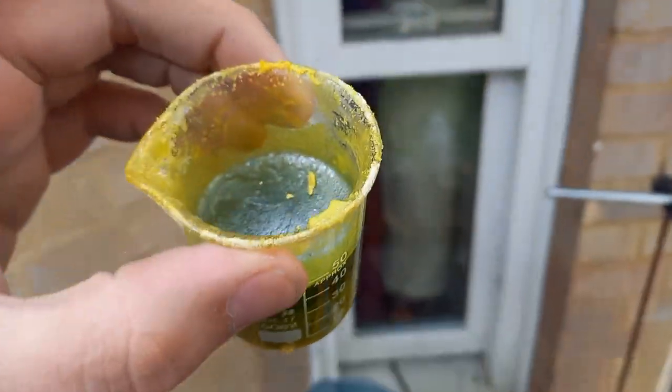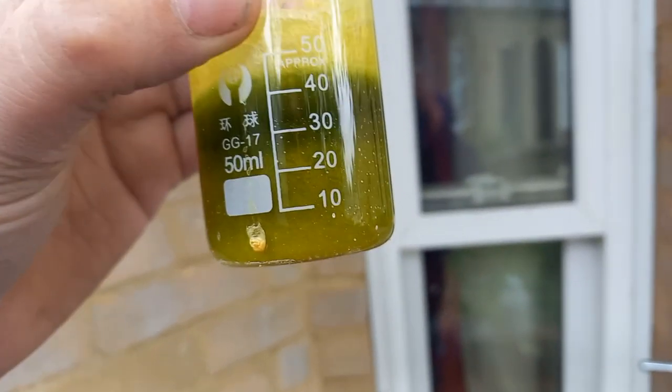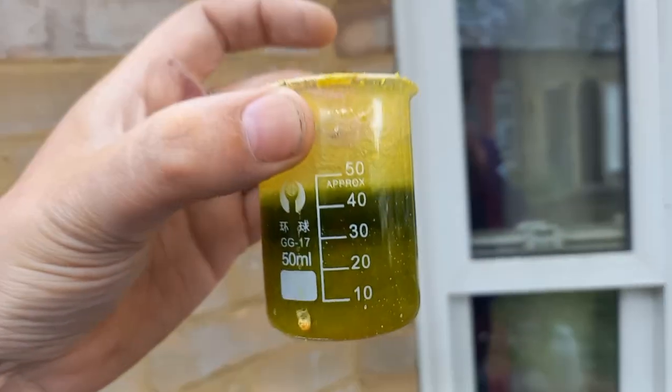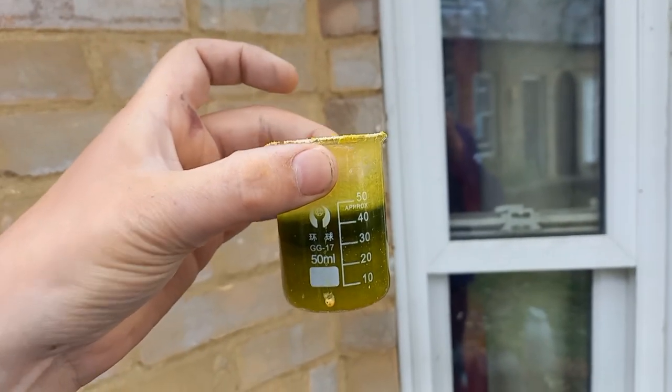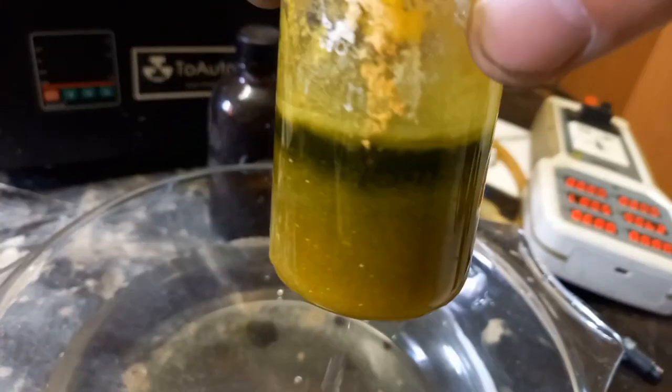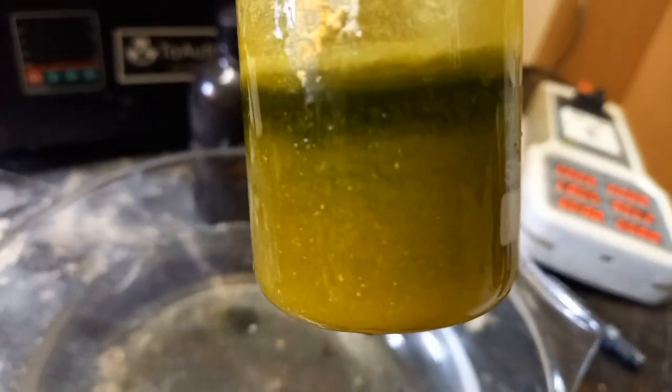It's still hot but there's so much crystallized out. I'll put this in the fridge and then filter it. Water seems to do the trick. Look how much product there is — crystals.